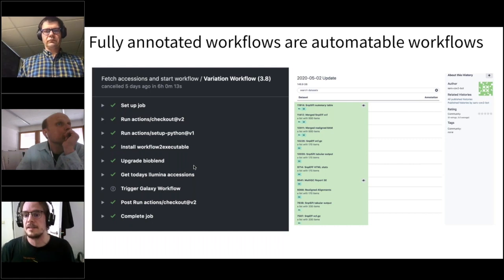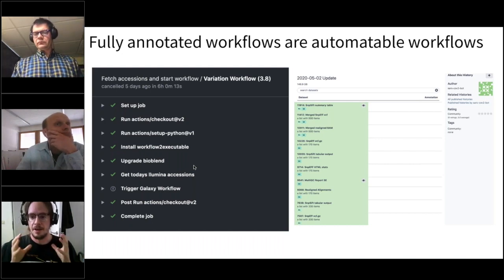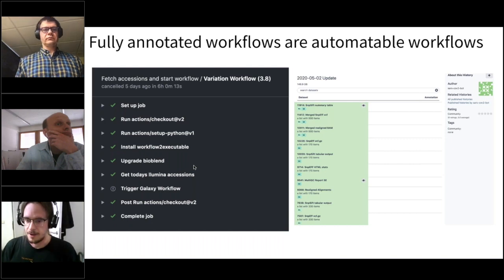And at the end, you get a single table out. Of course, there's also a MultiQC report with all the different quality control things that you want to look at. There's also VCFs and BAMs for genome browser visualization. But I think the most important output here is the summary table of all the variants found.